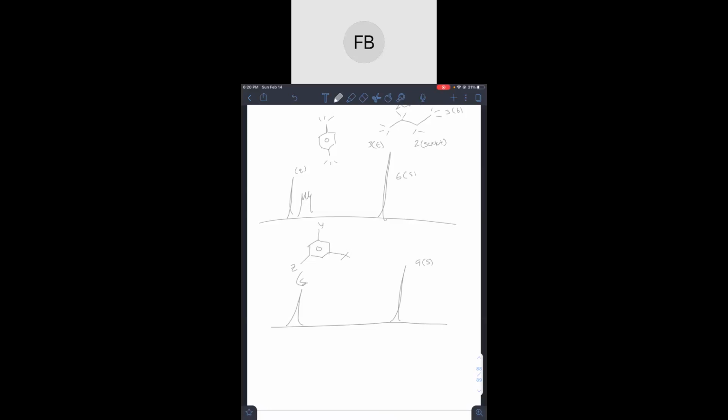So that tells us that there's 9 hydrogens that each have adjacent to 0 hydrogens. So now we know that these are just methyls, because CH3, CH3, CH3, and if you look over the carbon next to it, there's 0 hydrogens on that carbon. Okay. Next, let's get into something a little bit more complicated.